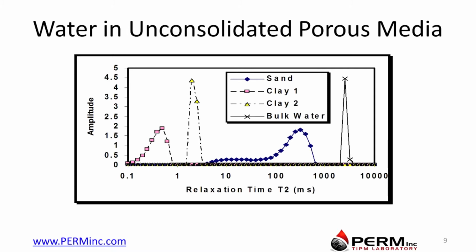Now when we have clays present, clays are even smaller particles now, and the spaces between the clays are even smaller. And so essentially we have smaller and smaller pores and faster relaxation times of water. So water, again, the relaxation times are related to the pore size distribution. And if you have slower relaxing water, this is water in sand. Faster relaxing water is water inside clays.